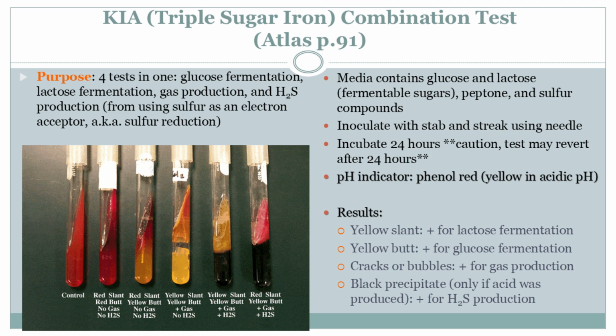Okay, those sound pretty intense. What do those indicator chemicals do? They're like our spies on the inside. They give us visual cues about what's happening in the agar. For instance, phenol red. That one changes color depending on the pH. So if the bacteria are producing acidic byproducts while munching on those sugars, the agar will turn yellow. So that's how we know they're enjoying their meal.